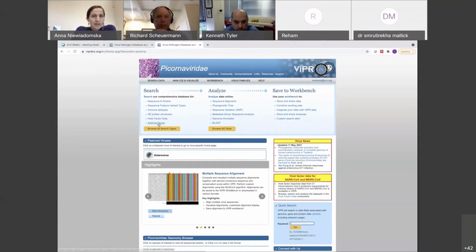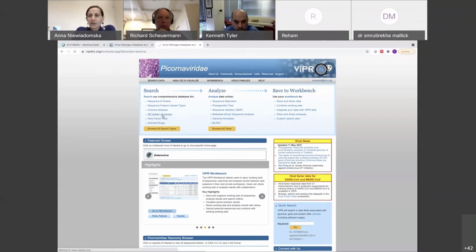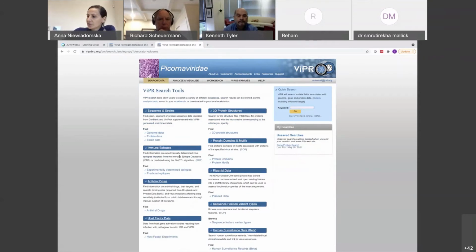So I'm going to go ahead and click on search and just give you a quick idea of the different types of data that are available. The most commonly used search feature is the sequences and strains.